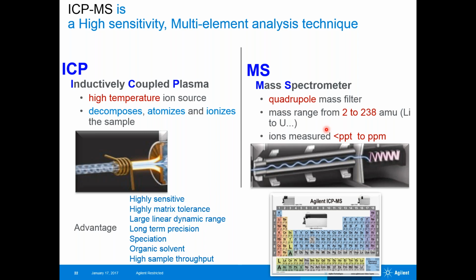So nowadays, 10 orders of dynamic range means, suppose you want to estimate elements, say you are looking for heavy metals, you are looking for micronutrients in food, all the elements you can estimate in a single run, because here it is a 10 order dynamic range.